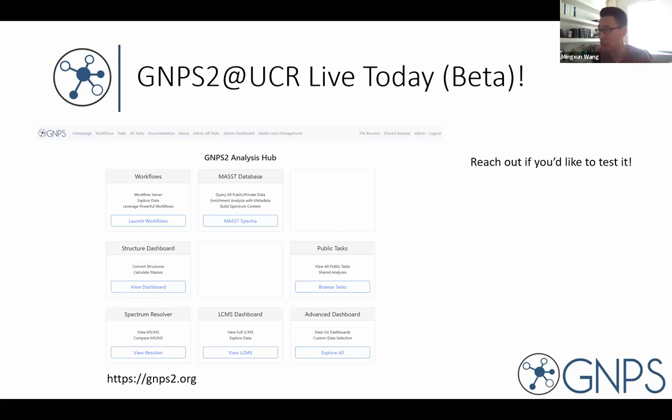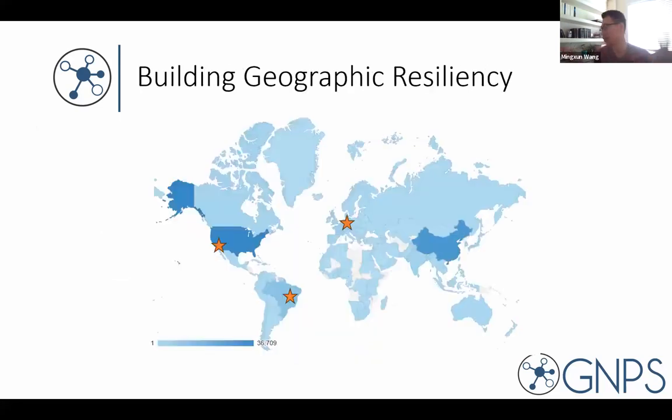So GNPS2 at UCR is live today. It's in beta. So if you'd like to try it, reach out. We can make you an account. Again, we have very modest resources in my new lab there, but we're happy to share with the community in that respect.